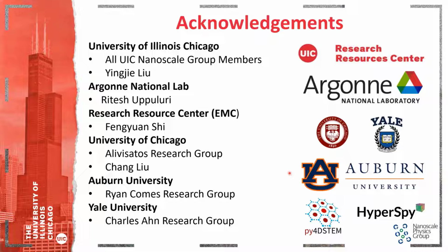With that, we are at the end of the presentation. I hope we could show you the various different experiments that are now being enabled by the new ClearView camera, ranging from 4D STEM analysis of thin film crystals to in-situ videos of phase transformation at various dose rates, and ultimately the combination of those two, taking videos and 4D STEM data sets under in-situ and in aqueous environments, and really combining this to get a full understanding of the dynamic behavior of nanostructures under various external stimuli.